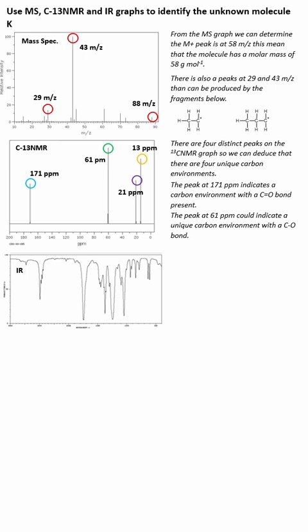Anyway, let's have a look at the IR here. So we're only looking to the left of the 1500. Anything to the right is called the fingerprint region. This is not a good place to look for evidence of stretches or bends of specific bonds, because they're not always strong and in the same place. However, it can be used to identify a molecule if I know what its graph should be beforehand. Hence, anything to the right of 1500 here is called the fingerprint region.